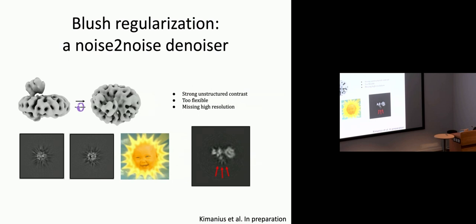You can see where I haven't pulled on the data, it's nice and flat, but all these are artifacts, and they start to affect the angular assignments, and the resolution of the reconstruction gets stuck because it's a battle between good alignments from the structure and bad alignments from the sunshine rays, which at some point you start to lose. And sometimes we use much sharper masks, but here, for example, there are other things.